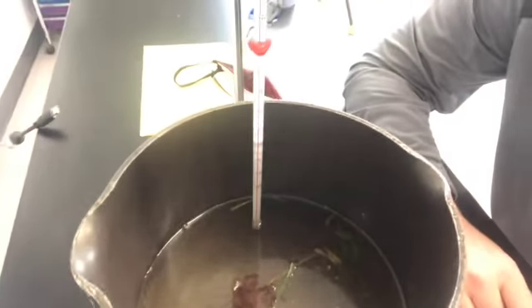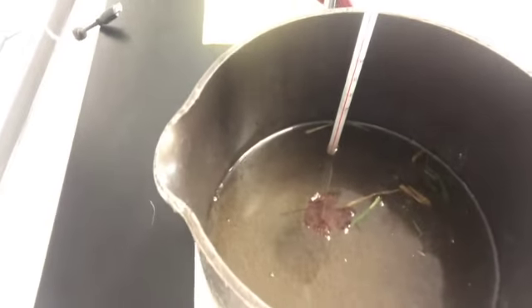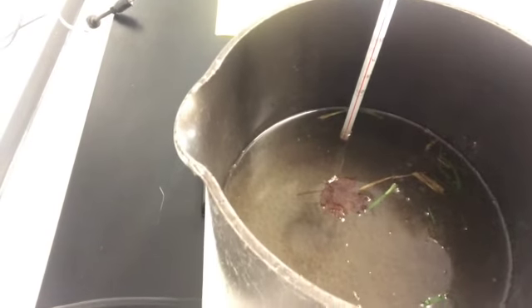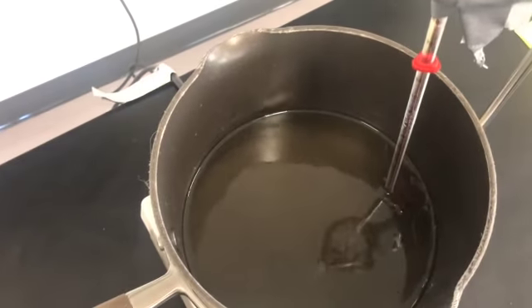You guys should try and start thinking. It's like when you're making macaroni at home. It's about time to put those noodles in there. All right, here we go. Another 5 minutes.